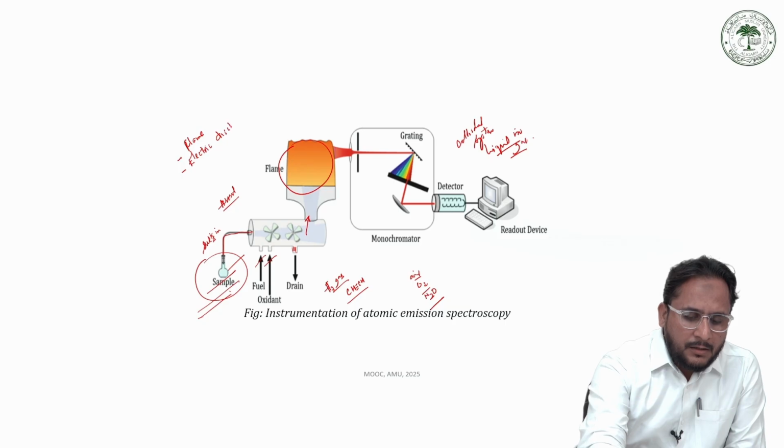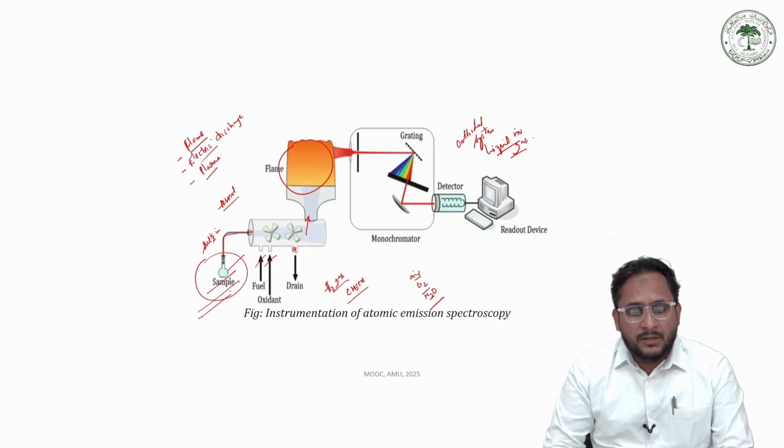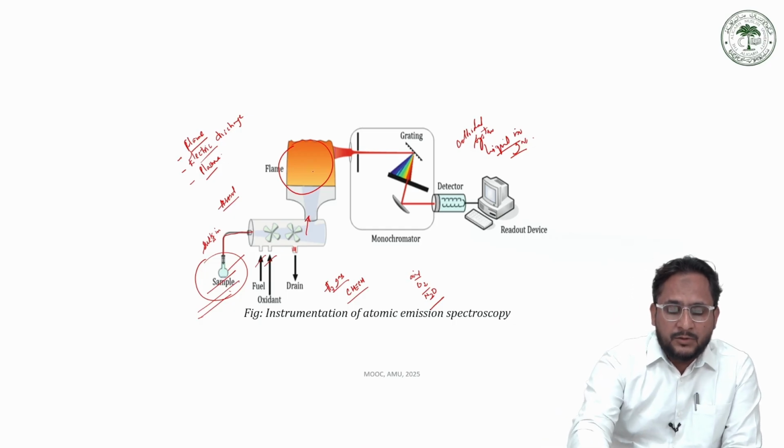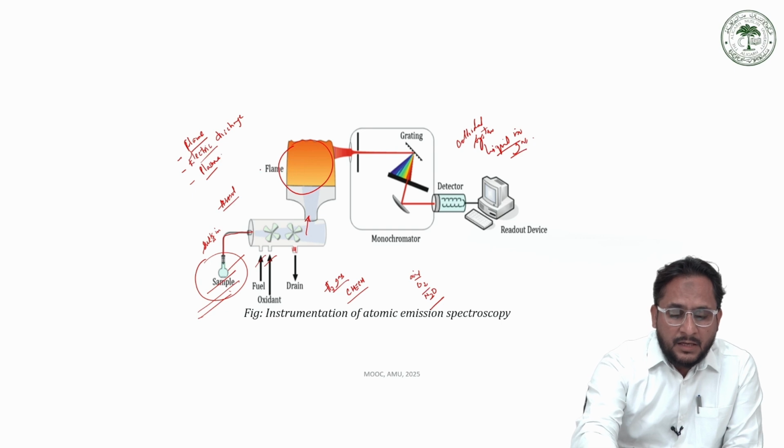And the third and best way is to use a plasma. Either of these sources are used as excitation source.